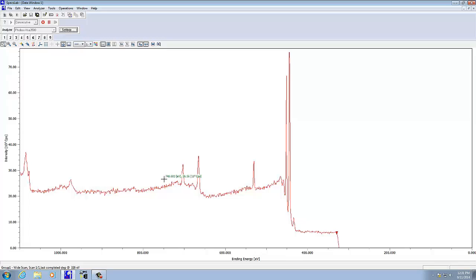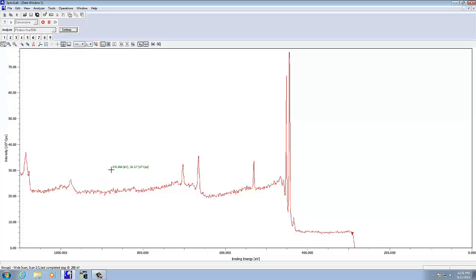In some cases you might wonder if this is a peak or if it's noise. In that case you can always go back and do another scan or add to it, add the number of scans to it, and that will help to reduce or increase the signal to noise.